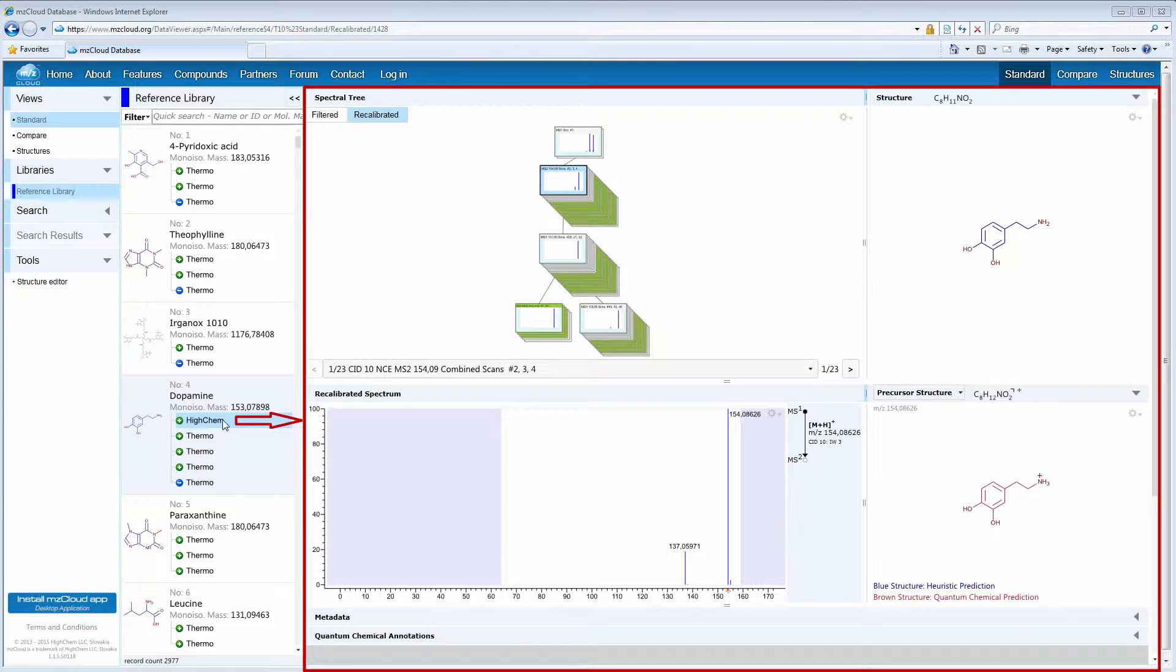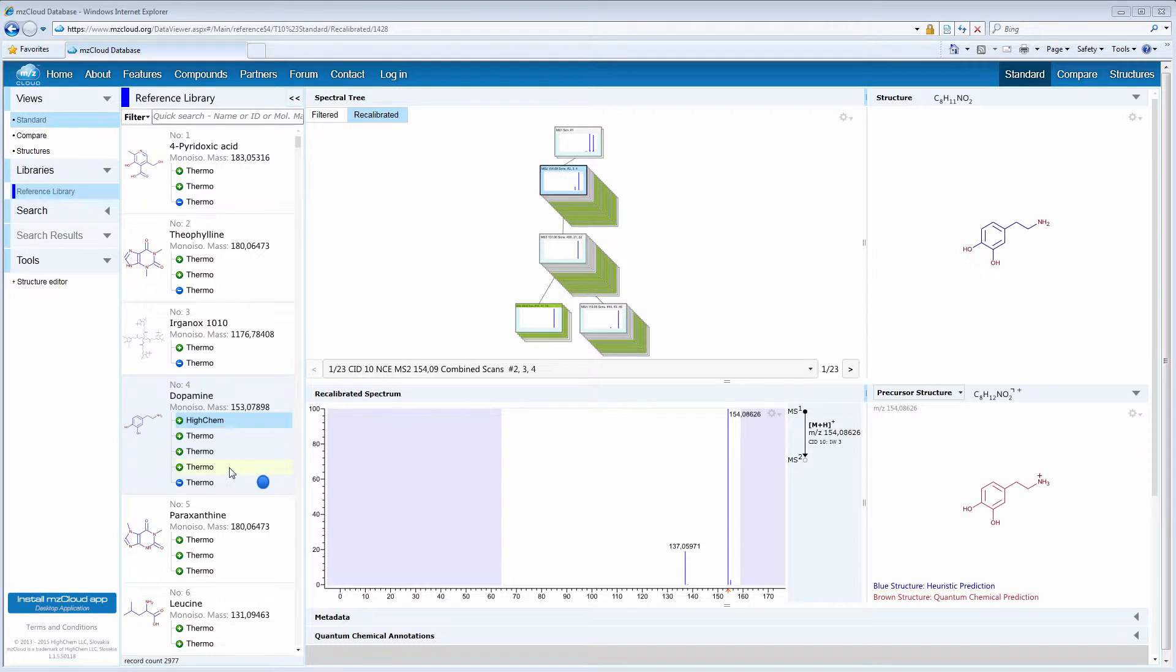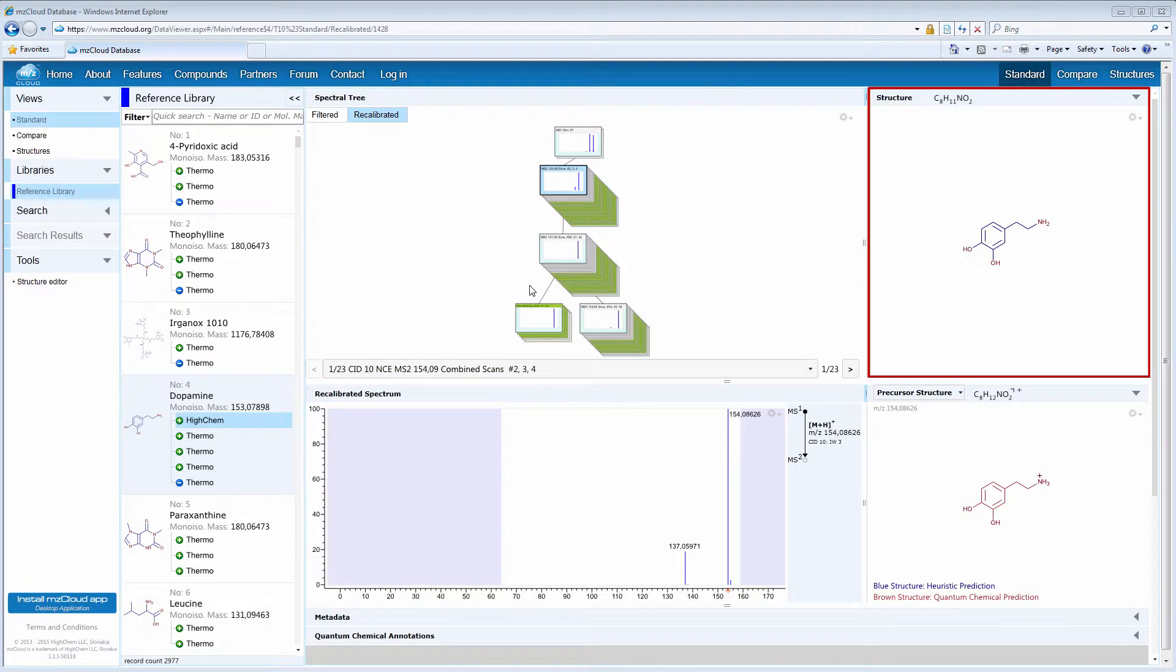This is one record that corresponds to a unique compound, and it contains spectral trees from various contributors, in both positive and negative modes if available. The spectral tree that consists of product ion spectra acquired at various MSN stages is accompanied by the corresponding chemical structure.